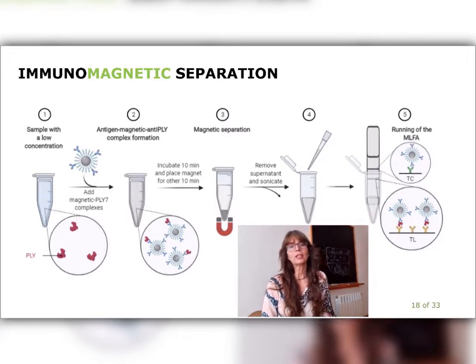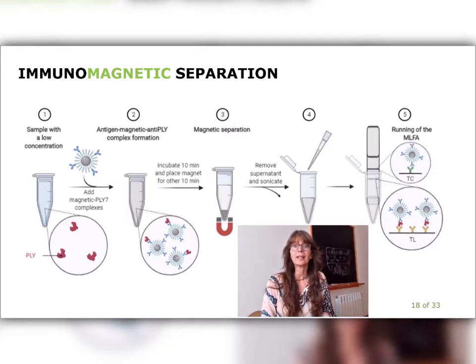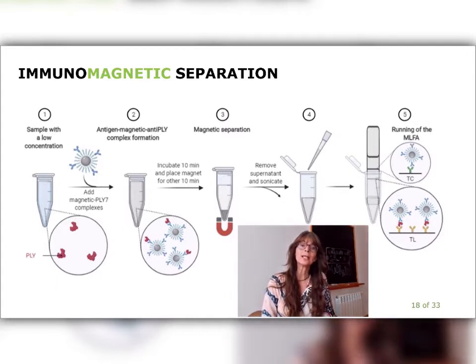Immunomagnetic separation is a technique to isolate the cells or the biomolecule of interest out of the body fluid. Like this, we can separate the target molecule from a sample matrix, which can be complex and interfere with the rapid test. Besides, the same idea is tremendously helpful to increase the sensitivity by concentrating the analyte before running the test. And this is what we are using here.